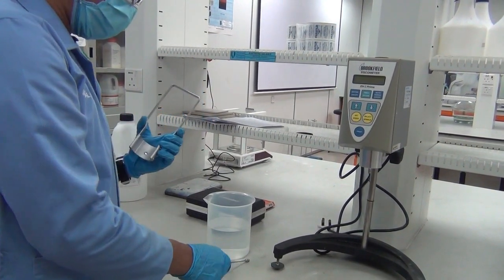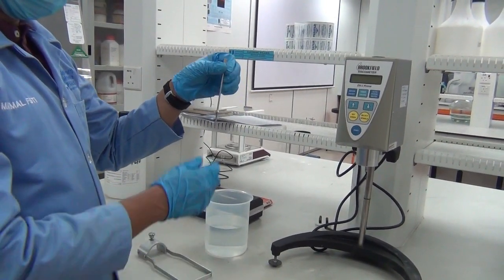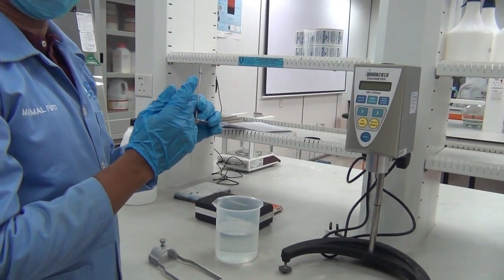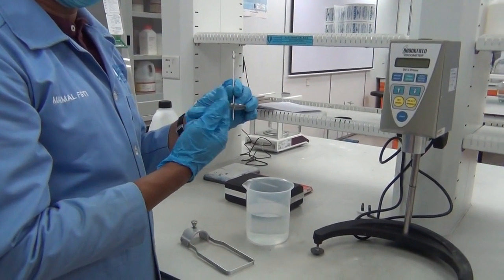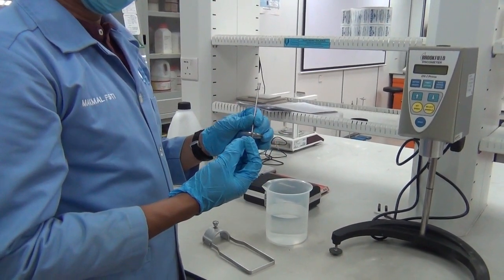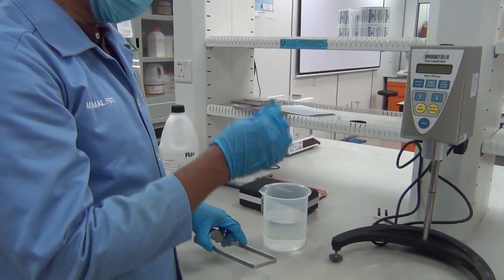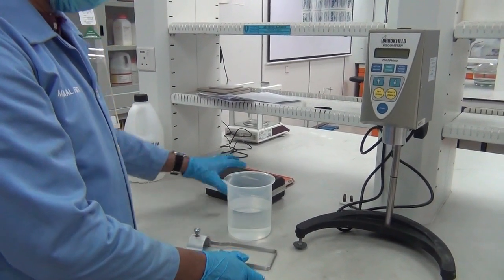During the measurement, when the spindle rotates, sudden turbulence or secondary flow can occur. Let's say we put a higher RPM or higher speed, then the secondary flow will occur. So we have prepared all the apparatus here.